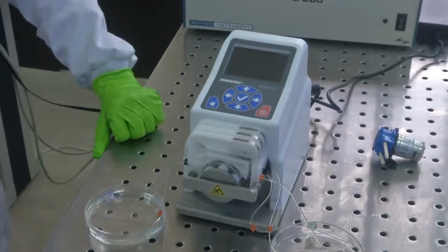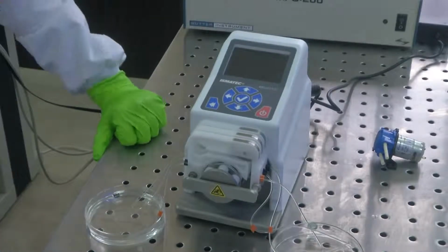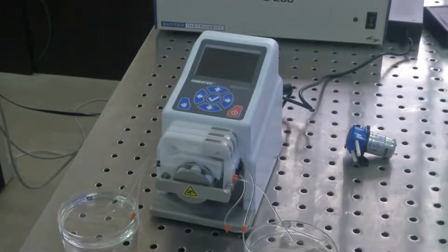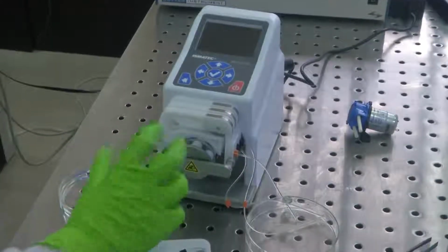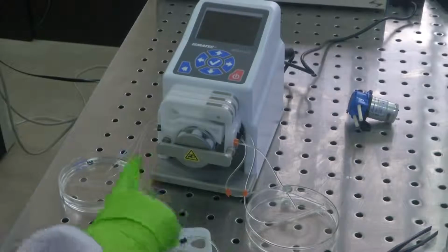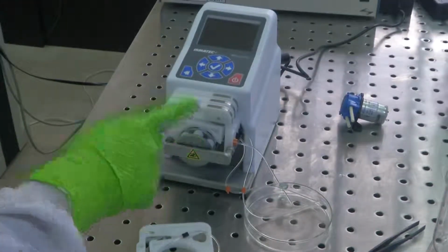Now, each of these rollers will compress the fluid. As each of these rollers moves, they form a compressing action on the tube. The tube will be squeezed continuously through the roller and displace the liquid in the direction in which the roller head is moving. Say this roller head moves in the clockwise direction, so your fluid will be displaced in this direction, clockwise. It also depends on which direction your motor is rotating.